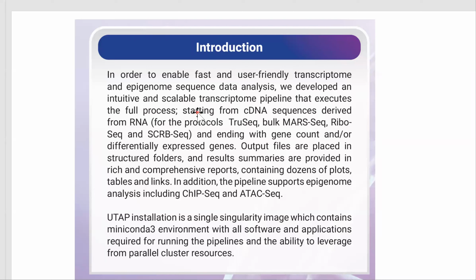UTAP supports the transcriptome pipelines, starting from cDNA sequences and ending with gene counts and differentially expressed genes. The outputs are placed in a structured folder, and the results are summarized in a rich and comprehensive report. We also support epigenome pipelines, ChIP-seq and ATAC-seq.